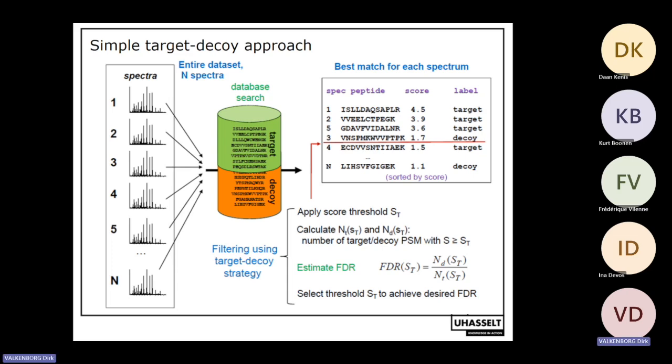If we do that many, many times, knowing for sure that this is a fake random peptide, then we have an idea about how this score is distributed. But it's a complicated procedure, and it comes with a lot of problems. How random should such a peptide become?